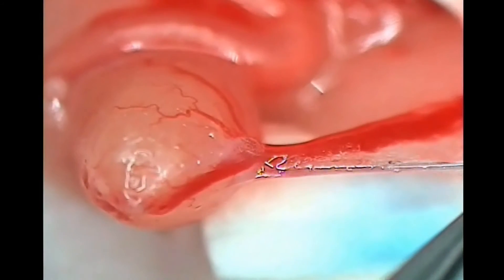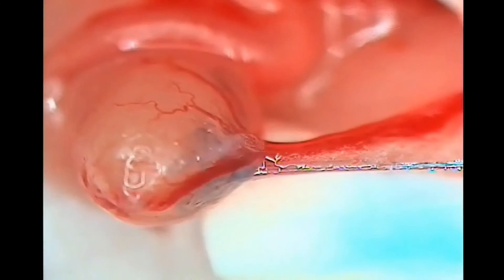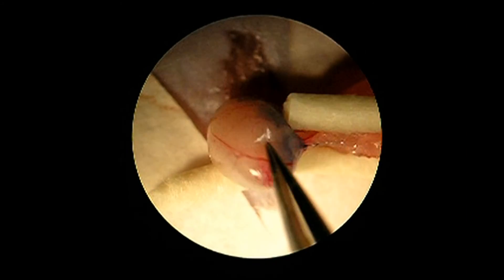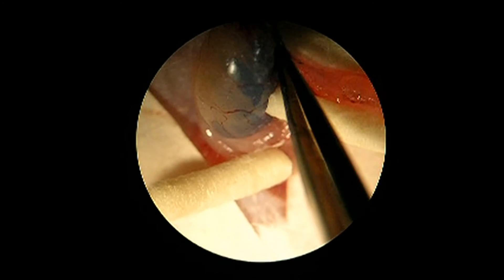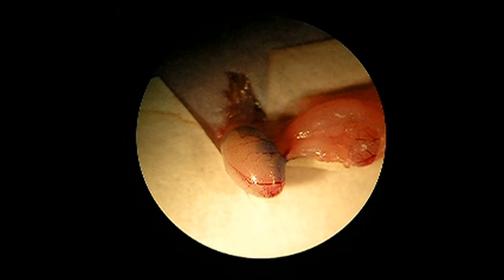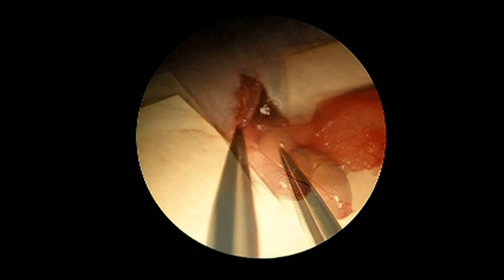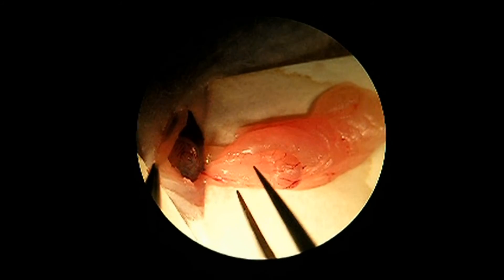Here you can visualize the injection process with higher resolution. Usually, the rete testis can be visualized as a small clear zone at the intersection of testis and efferent ducts, that is filled up just before the blue staining starts to be distributed along the seminiferous tubules. The injection is complete when 60 to 70% of seminiferous tubules visible on the surface of the testis are filled with blue dye. After the injection, carefully remove the needle and sponges. Next, carefully return the transplanted gonads. In order to prevent testicular torsions, return first the testis and then the epididymis, followed by the fat pad covering it.